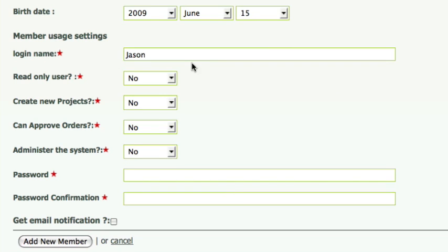Read only user means the user will be able to see all projects but not have the ability to add or to edit, so I'll keep it as no.